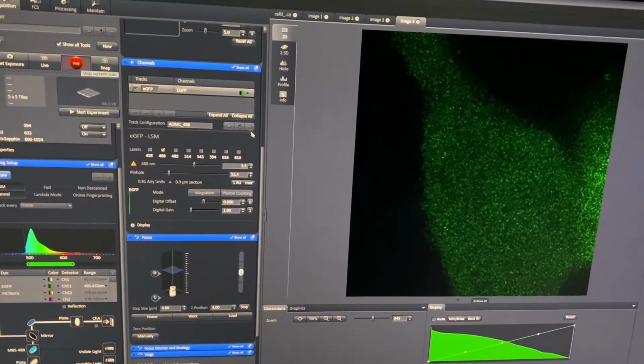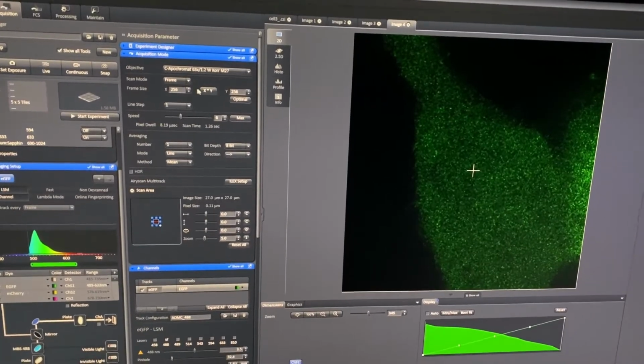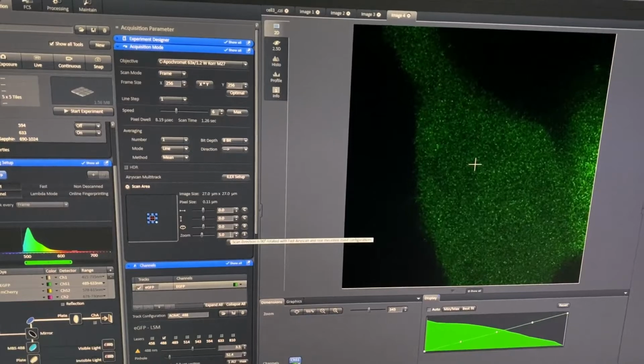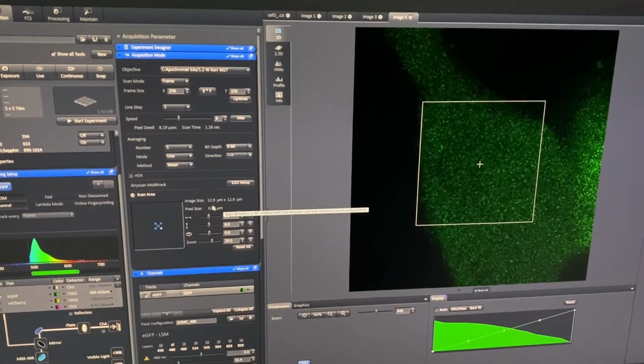And what I'm going to do right now is to put the pixel size to 50 nanometers, because that's my predefined parameter I use for my analysis as well. So I already know that I need to zoom in 10.5 times to reach 50 nanometer pixel size.